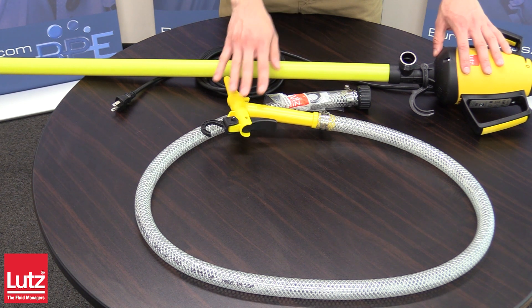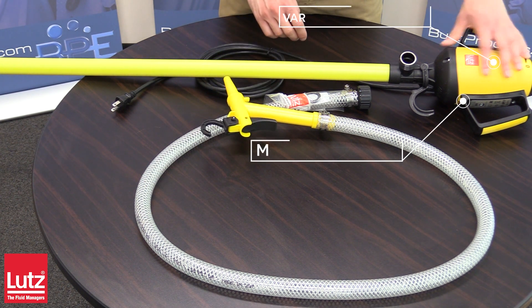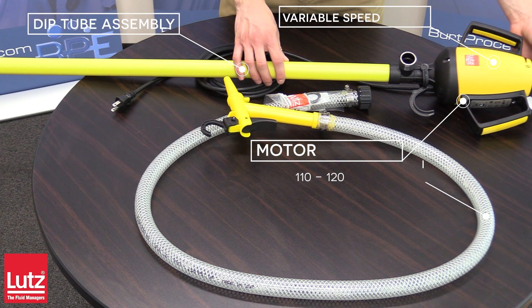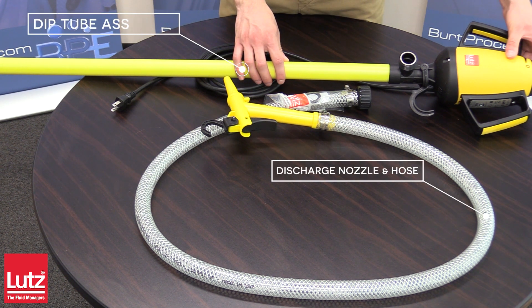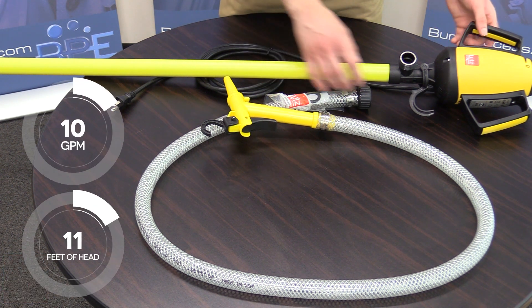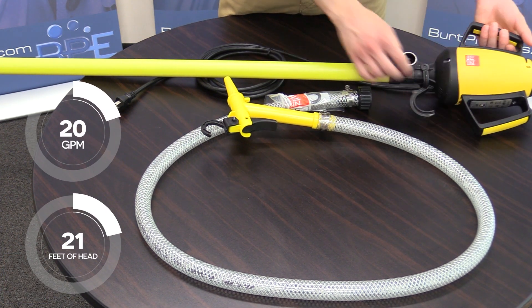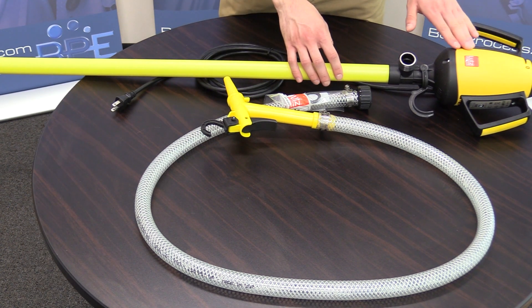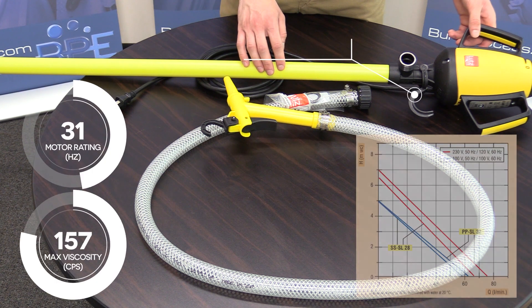The Lutz Drum Pump Set has three main components: the motor, the dip tube assembly, and the discharge nozzle and hose. The motor features an ultra-quiet variable speed motor with a safety cutout, ergonomically designed handles, direct coupled design, and a hanger for the nozzle is provided.